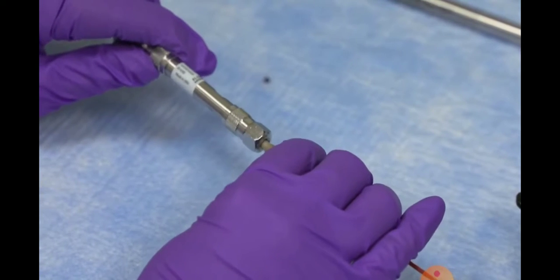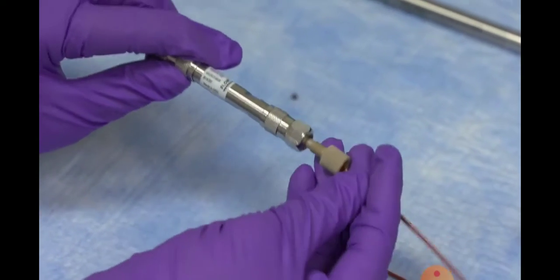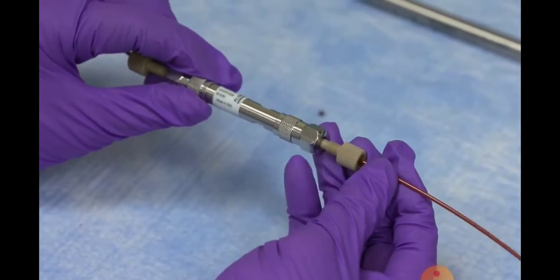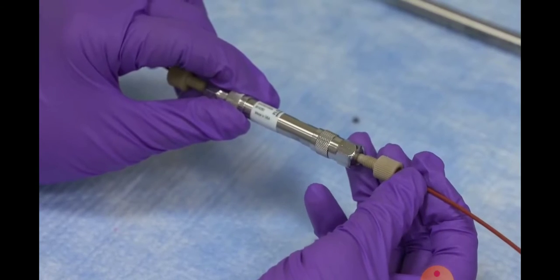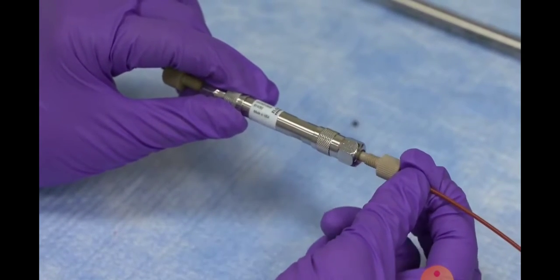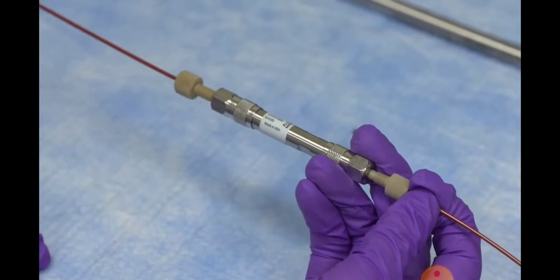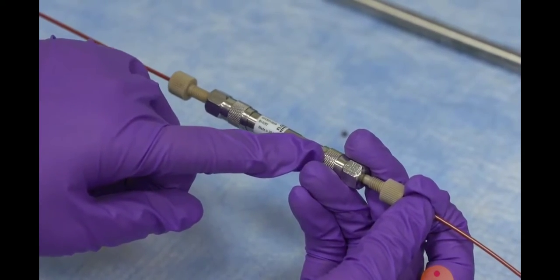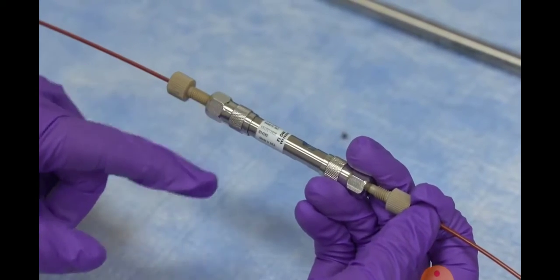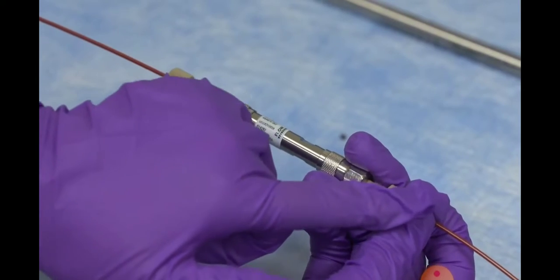To know which side you will attach this ferrule to is by knowing the flow of the solution in the column. The column has a pointer indicating which way the solution flows. In this case, the solution enters from the pump, from the HPLC, from this side. So you attach the ferrule by tightly securing it on this end.